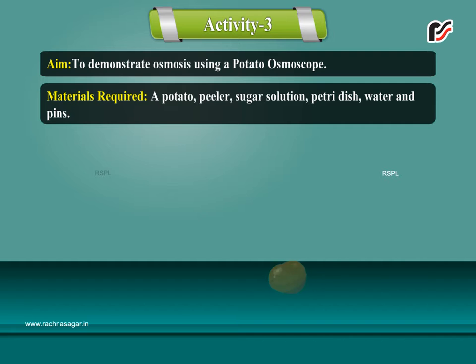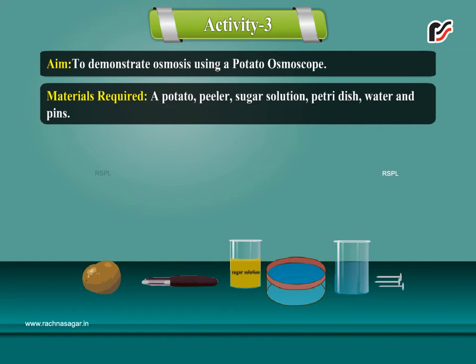Materials required: A potato, peeler, sugar solution, petri dish, water and pins.